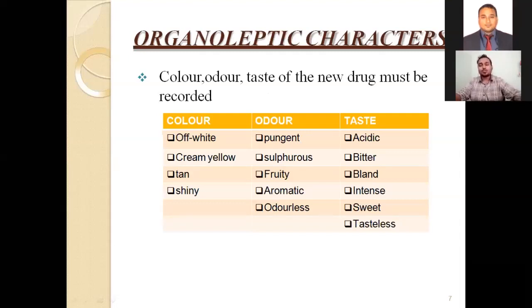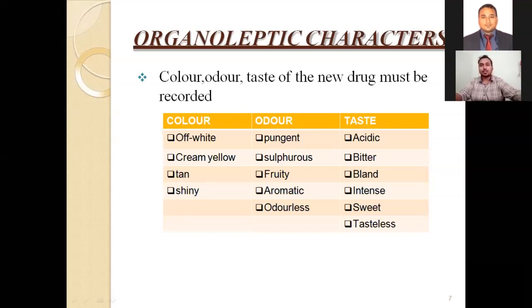For organoleptic characteristics, we have to examine the color, odor, and taste of the granules. This is the main part of the organoleptic properties. For color, we can observe: it may be off-white, creamy, yellow, tan, or shiny. These are the colors we can see.